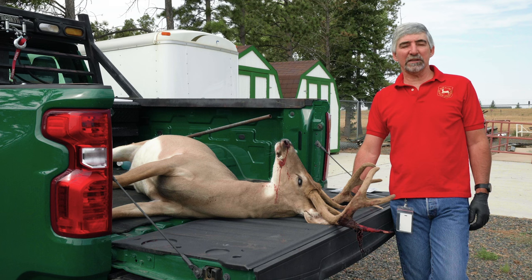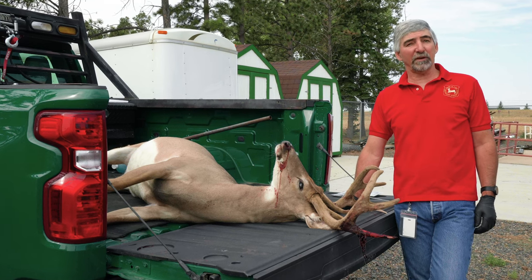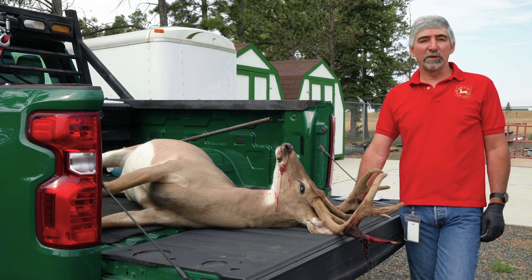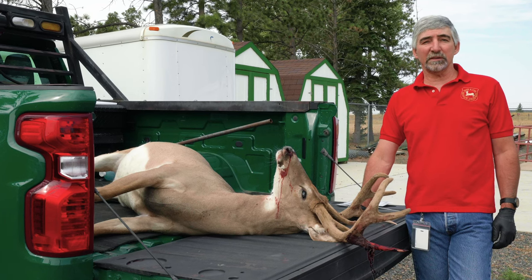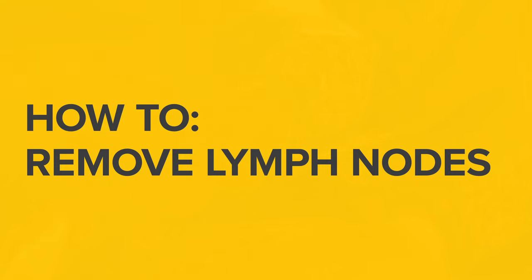Chronic wasting disease has really become what we think could be a pretty significant effect on some of our populations, particularly deer. So getting these lymph nodes so we can monitor both the distribution and the prevalence of this disease is really important. I'm going to show you today one of the many ways to take out a lymph node.